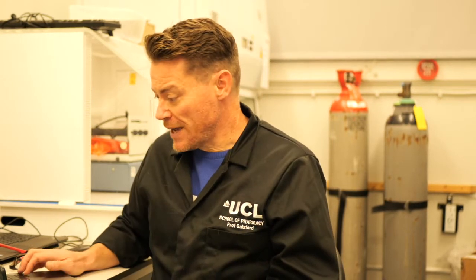Why do we use microscopy? It's simply because many medicines are complicated structures. They might have very porous structures, or they may have lots of different components, and so visualising a sample is a really good way of trying to understand what is where. It's quite hard to do with any other type of analytical measurement. Those measurements typically tell you what's in a sample but not where it is, whereas imaging allows you to say for certain, yes, I've got lumps of drug in a polymer, for instance, or yes, I've got a porous structure. You can't really tell that any other way.